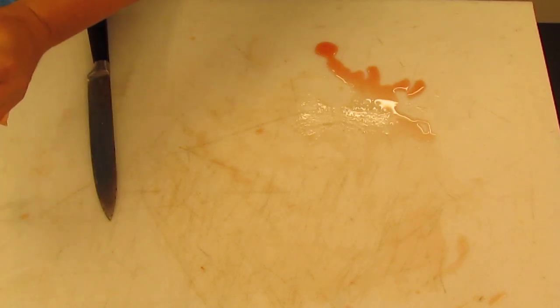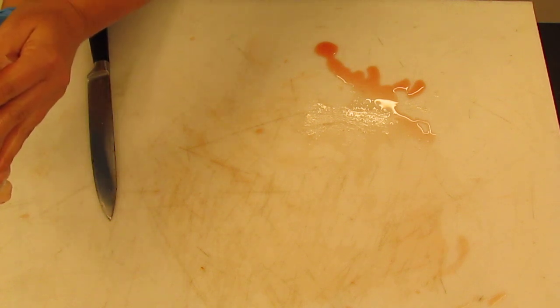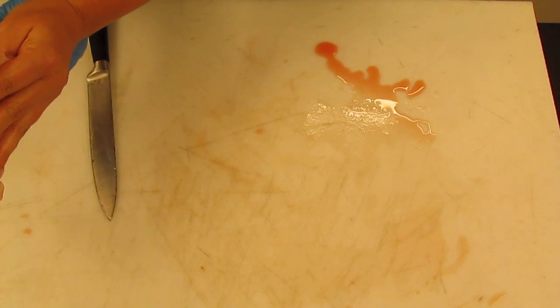There is a thin, light, almost white colored tube right here. And in this bird, there's still even a little bit of blood. So this here is a blood vessel. Note that the blood vessel is dipping down in between this muscle and this muscle here, and ultimately delivering oxygenated blood to these muscles. Okay, it is right next to the bone here. And again, light in color and a little bit of blood is still inside.